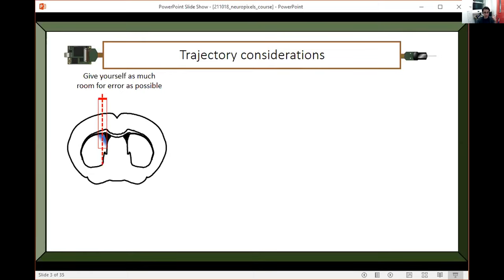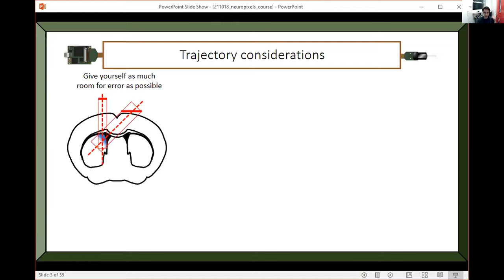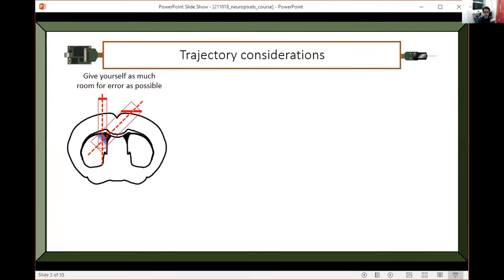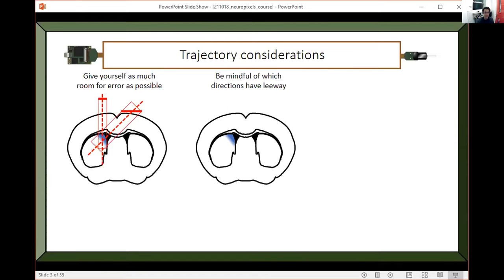One of the ways I can make this easier on myself is if I come in at an angle. Because I'm coming in essentially perpendicular to the shape of this thing, that means I've got a larger range where I can put my probe and still hit this area. Sometimes you're going to have to come at an angle to give yourself the largest possible space for getting it wrong, since you do end up getting it wrong a lot more often than you might think.